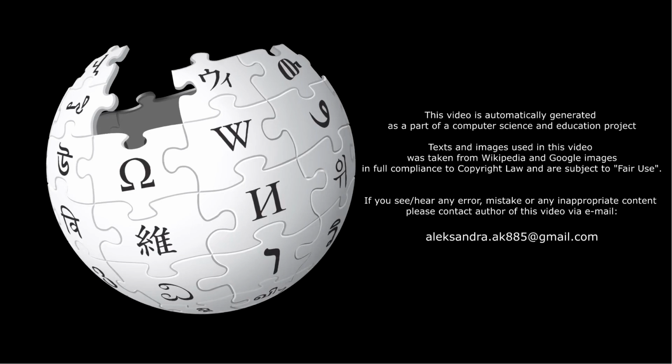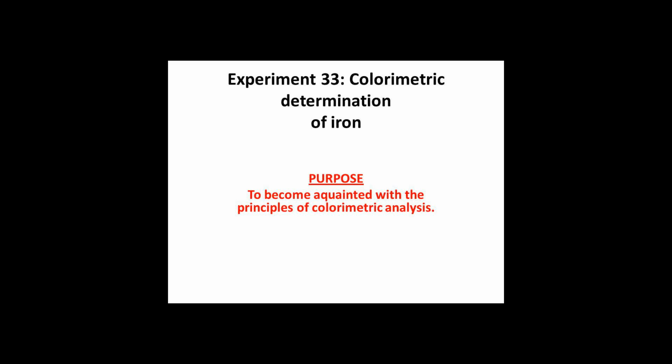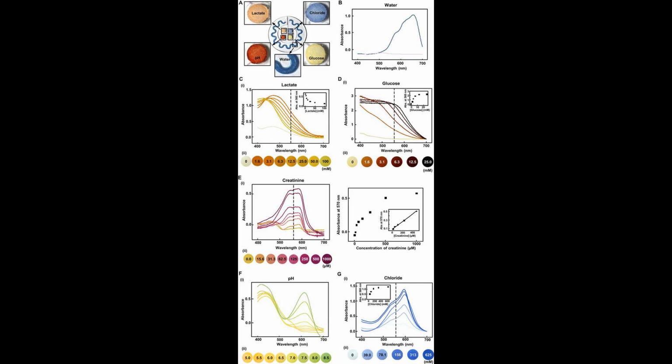Urea plus water, enzyme urease, to ammonium carbonate; plus phenol plus hypochlorite, to colored complex. In this case, only the first stage of the reaction is catalyzed by an enzyme. The second stage is non-enzymatic.